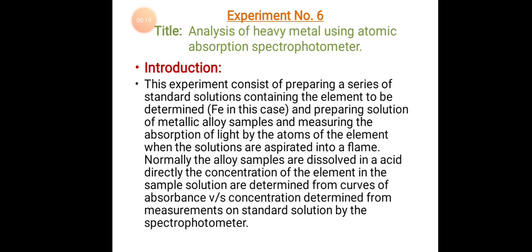Today we will see experiment number 6, titled Analysis of Heavy Metal Using Atomic Absorption Spectrophotometer.